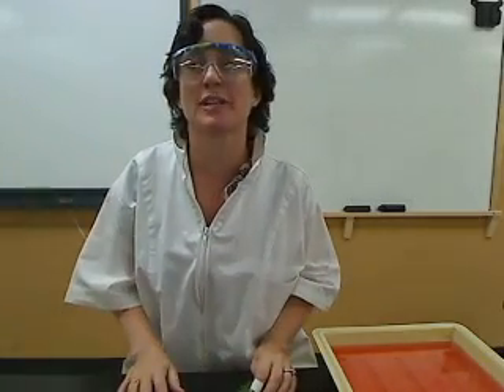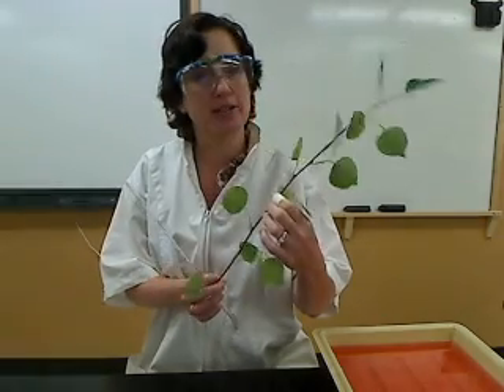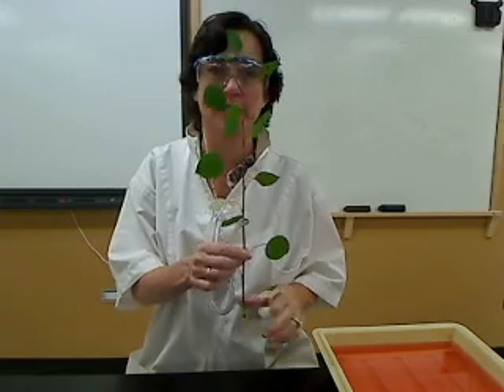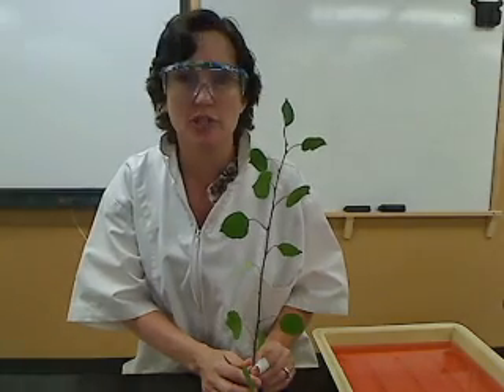Today we're going to do a lab where you create a potometer. A potometer is a setup that allows us to observe transpiration in plants. You can go out and select any leafed branch that you think is appropriate — I went out and snipped some Populus tremuloidus, the good old aspen tree. Your goal for this lab is twofold: first, set up a potometer to observe transpiration; second, change a variable to either speed up or slow down transpiration.